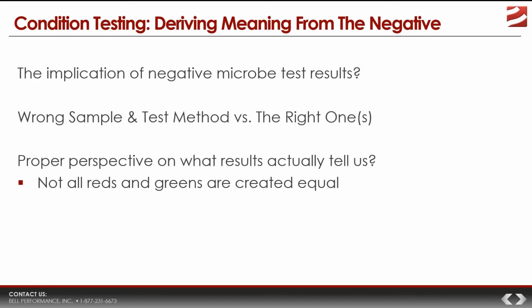Well, since the culture test is done on a fuel sample, if the sample was not really representative of the conditions in the tank, then the sample was wrong, and hence our test was wrong. Or it could be possible that, because the culture test might only detect a small number of microbes, maybe the culture test wasn't specific enough to show us the actual amount of microbial presence.